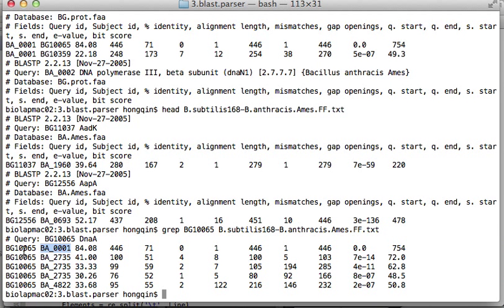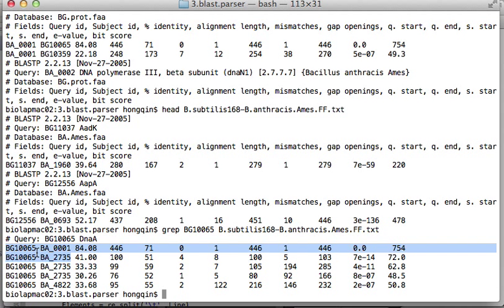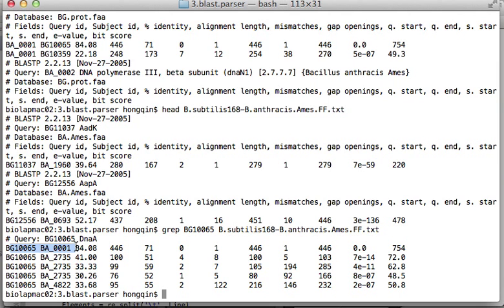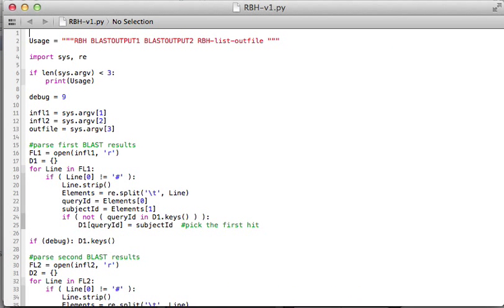It also hit against BA001. This actually is the reciprocal best BLAST hit. What the Python script is trying to do is basically find out the first hit for every BLAST in every BLAST output file, and then check whether these two hits are the same or not. Let's look at the Python code.